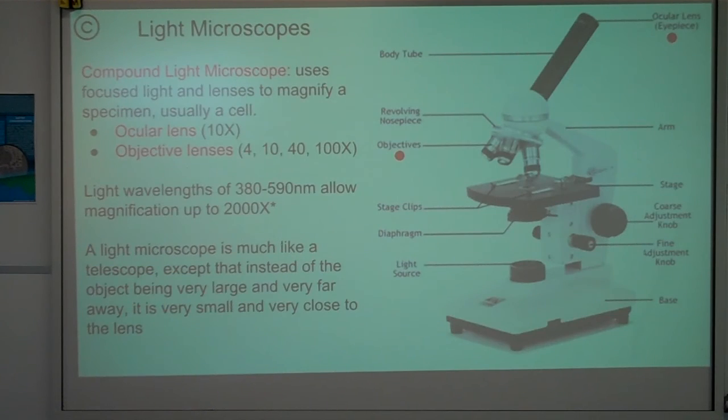Now, this is the compound microscope. This C up here means that's effectively a cram card. If you're an inherently lazy person, you could just print that off, stick it in your study notes, and off you go. You don't need to photo it. You can if you like. It's not an issue, but it's online and it'll print off nicely. But that's what the C stands for. So I'll try and keep giving you those hints, okay?